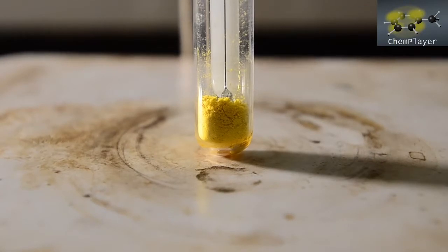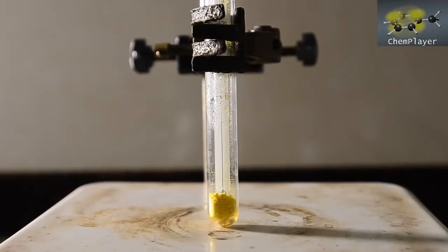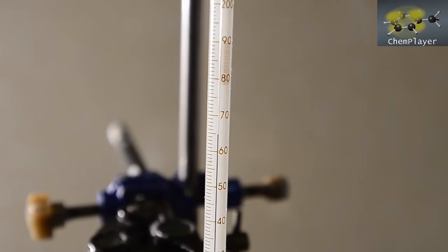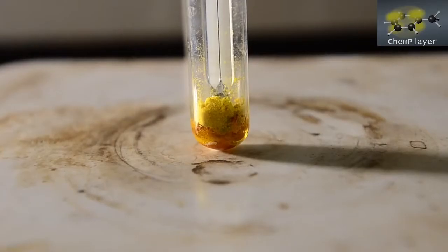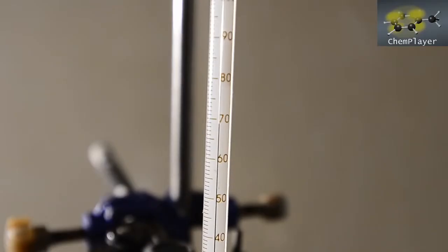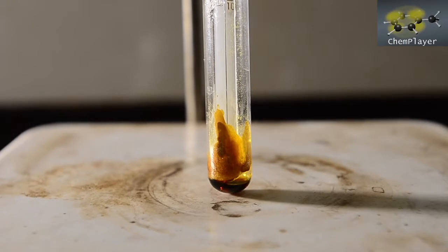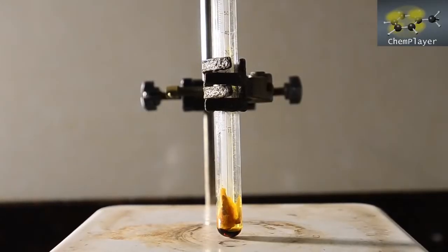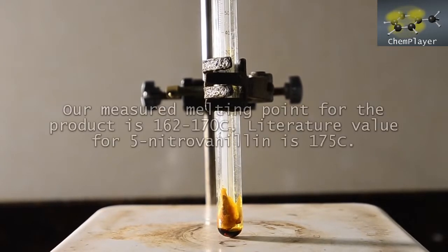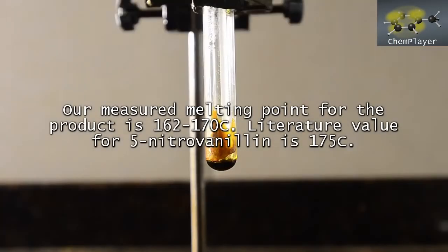And here's our first sign of the solid starting to melt right at the bottom of the tube. This happened at about 162°C according to the thermometer. Now continuing up, and we're definitely getting a liquid formation now in the tube. The temperature is nearly 170 degrees C. The temperature difference up from the hot plate means that we can't get it all to melt. And this shows why our temperature reading is likely to be on the low side if anything. But we've got the dark brown colored liquid in the bottom now. So our recorded melting point started at 162 degrees and went up to 170 degrees C.